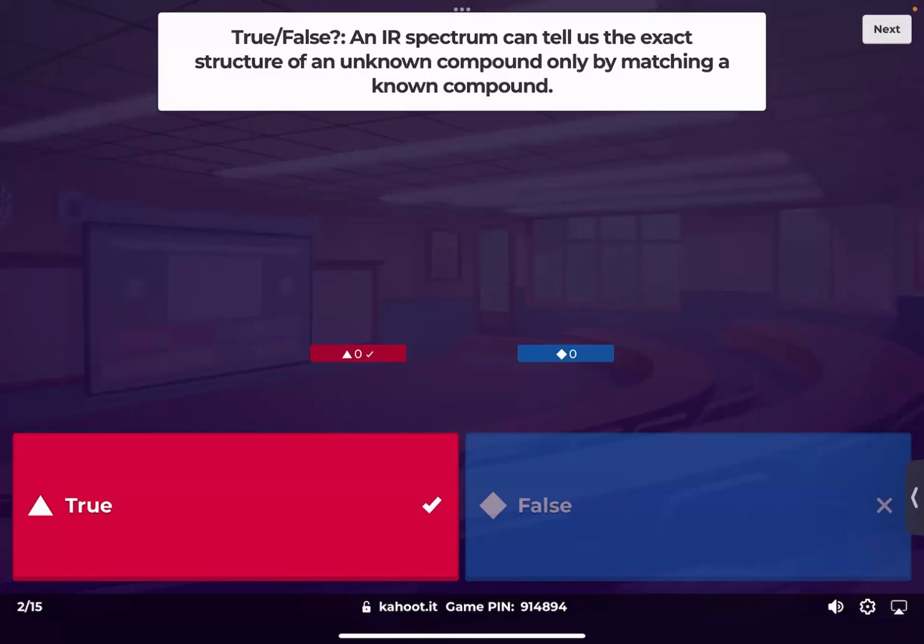Right. So if you're given an unknown compound, and you already know a compound from previous labs, and you shine IR through the unknown one, and if that IR matches the one that you know already, then you know that the unknown compound will be the exact same molecule as the known compound, if that makes sense. Oh, wait, is this question just about how some molecules can have the same IR spectrum but are slightly different?